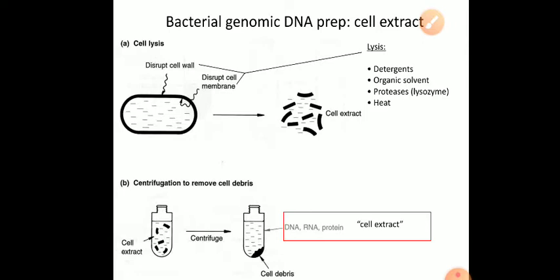Now, how much growth of microorganism is present can be checked by measuring the optical density of the broth culture at 600 nanometer. If the optical density is 3 or 3.5, sufficient growth is present and you can use the broth culture.